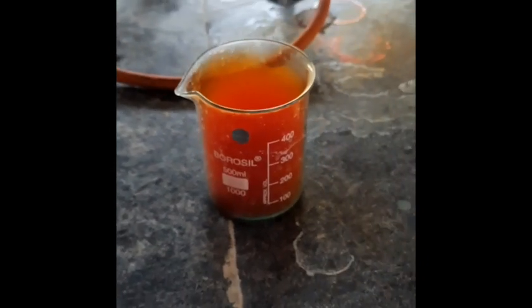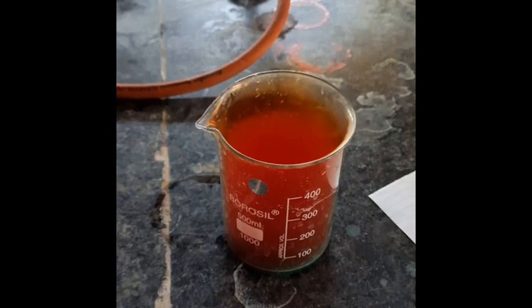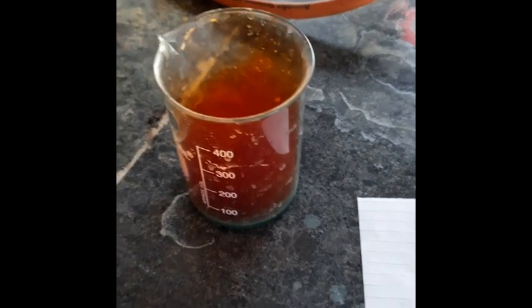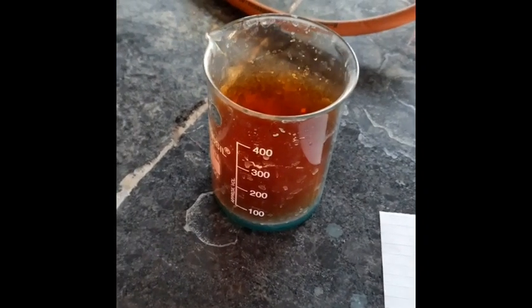Now you have to heat this copper ore till it dissolves completely. You can see the brown fumes evolved here. Now add 20 ml water in the same beaker. Now I am going to add the 20 ml water, and keep it for heating till the ore is completely dissolved.